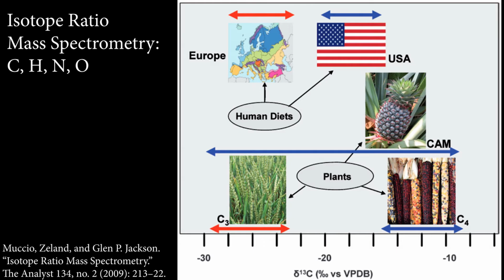So obviously there's a lot of promise there to be able to source things, to look at isotope ratios and say, where did this stuff come from? A lot of that promise has been realized, and you can use this data to try and figure out where things came from. It hasn't crossed the bar where you can use it reliably in court and say, this definitely came from this. But it is actively being used for intelligence purposes to tell people where things came from.